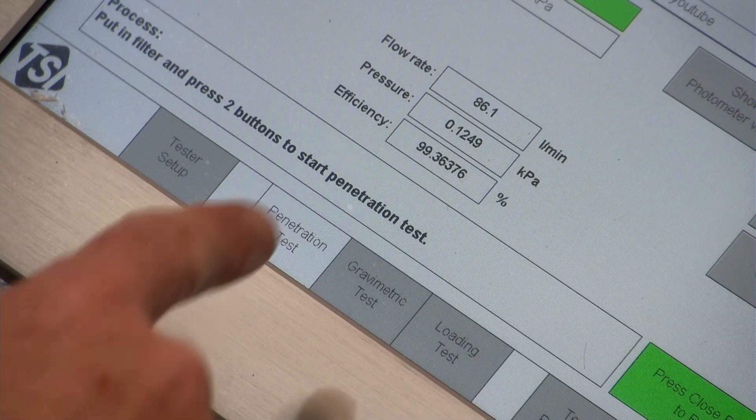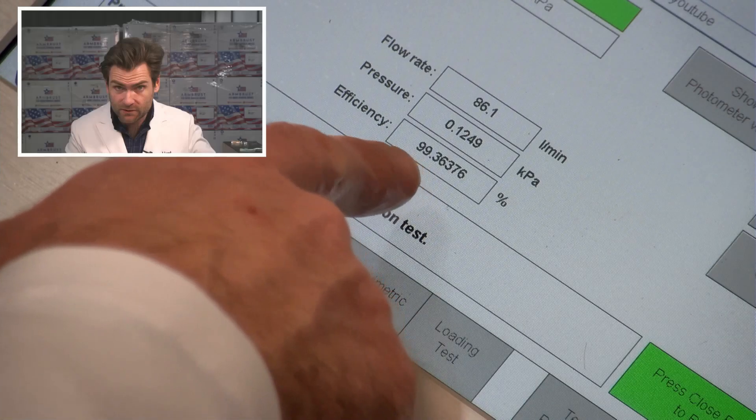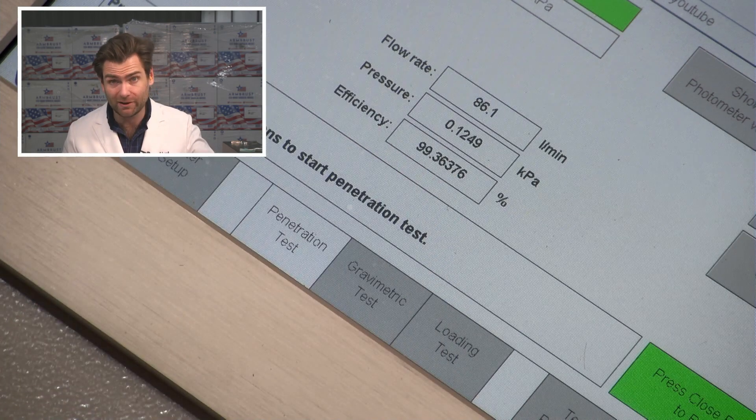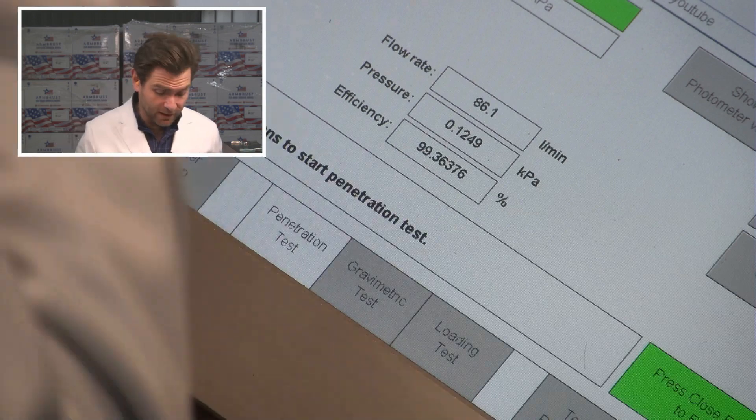Let's see what it did. 99.36. 124.9 Pascals. Solid mask.